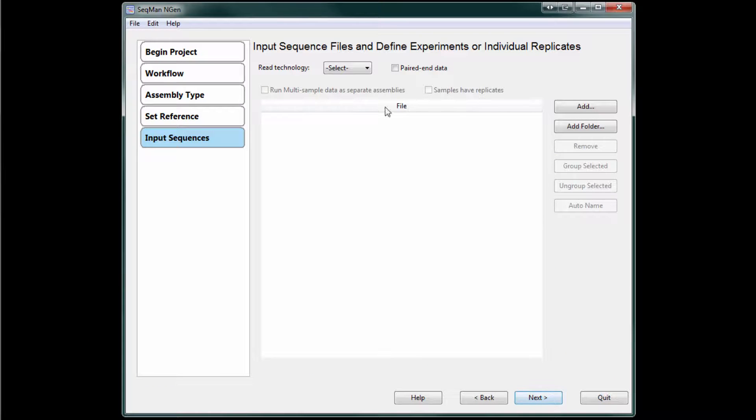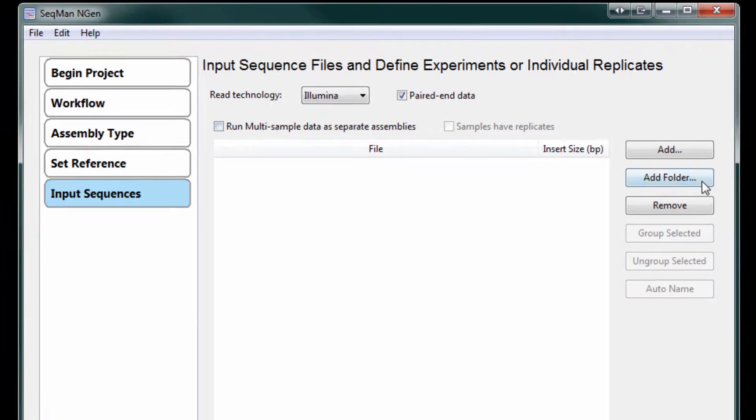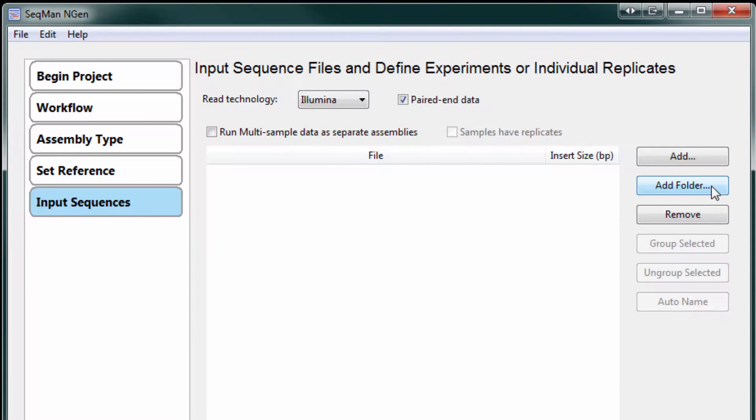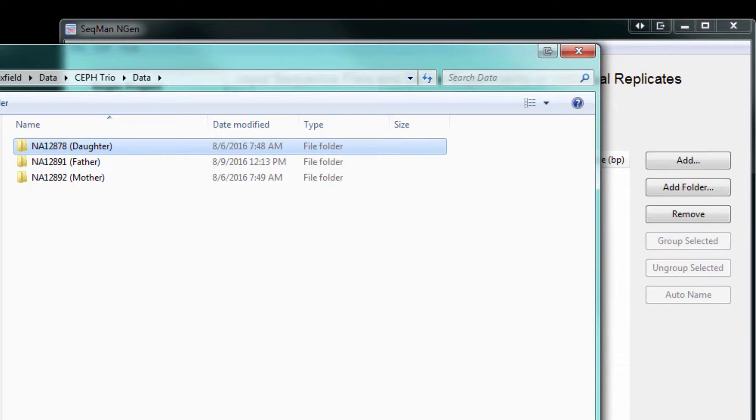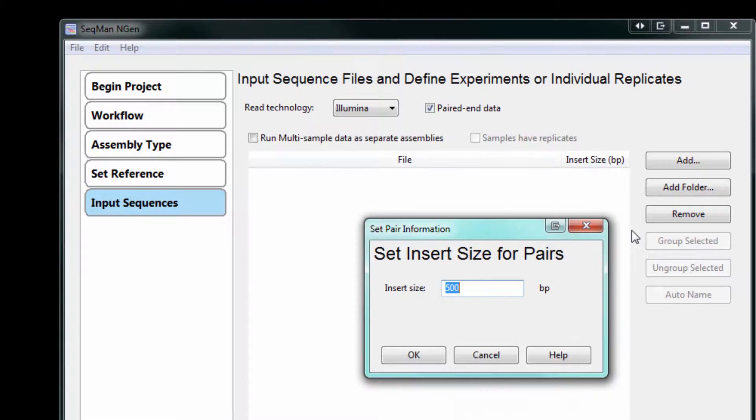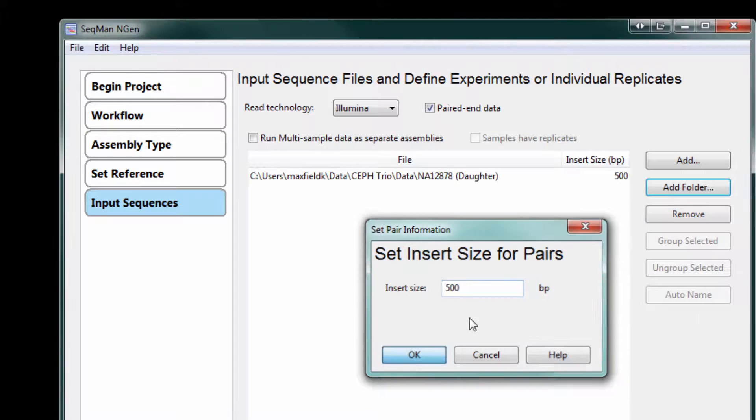Next, select your read technology and load your read data. So here I'm going to load a folder of reads for each sample.